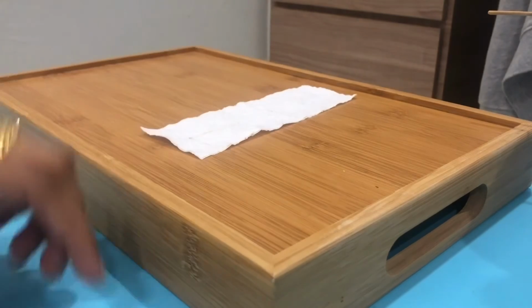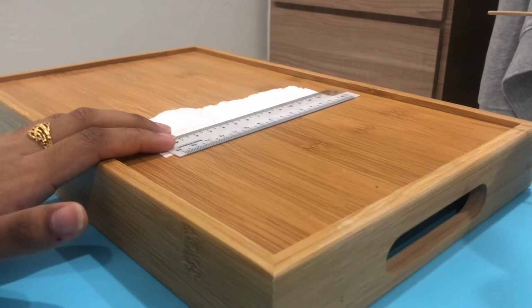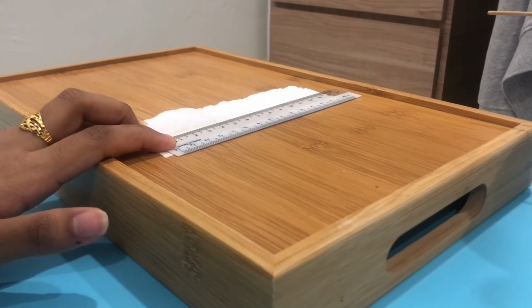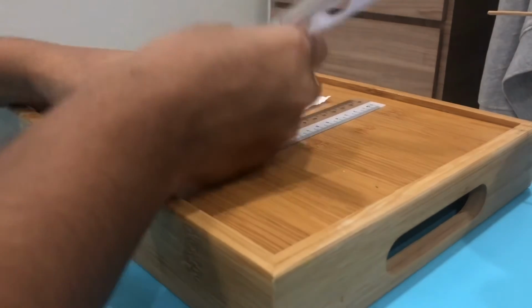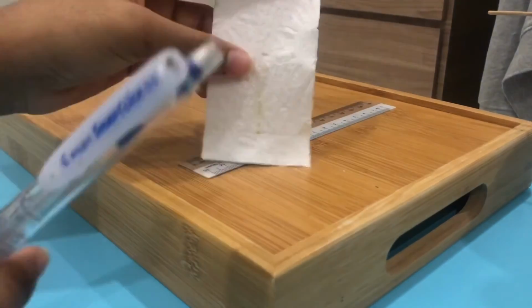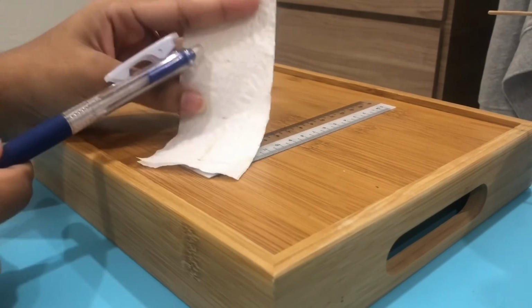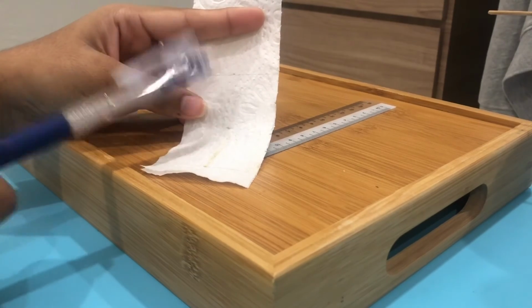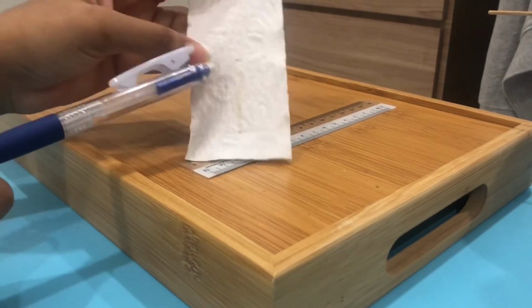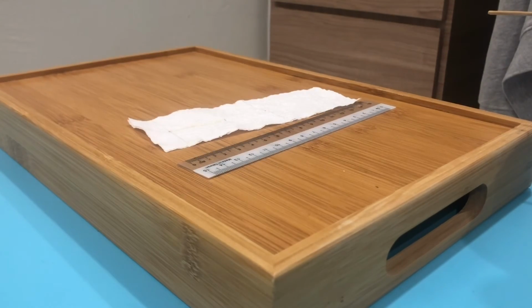So just repeating this step of measuring one more time. From the 1 centimeter, it traveled approximately 4.4 centimeters. There's a small pencil mark that I made here to show that it traveled about 4.4 centimeters. It did not manage to travel to the 7 centimeter line that I initially made, but it traveled up to this small line right here. So that is all for my experiment today.